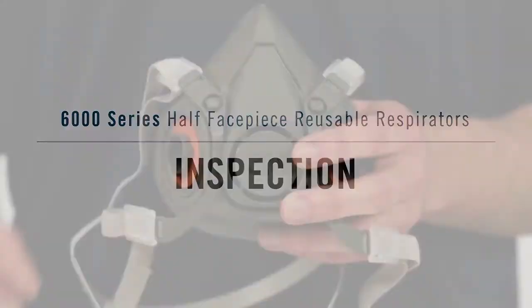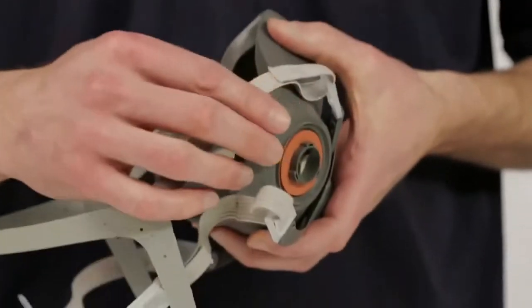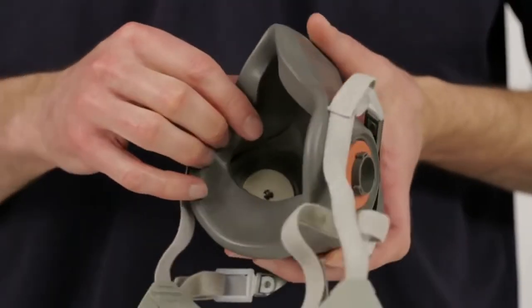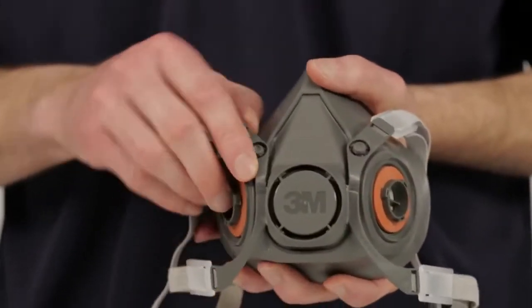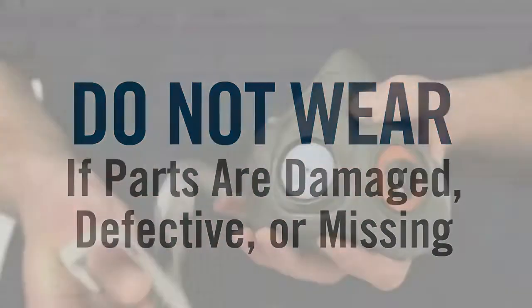Inspection. Before each use of your half facepiece respirator, inspect it for any signs of damage. Check the facepiece, gaskets, straps, and all plastic parts and valves for distortions, cracks, tears, and dirt. Your respirator will not function correctly, and your health could be jeopardized if your respirator has damaged or defective parts. If it does, replace them before using the respirator.